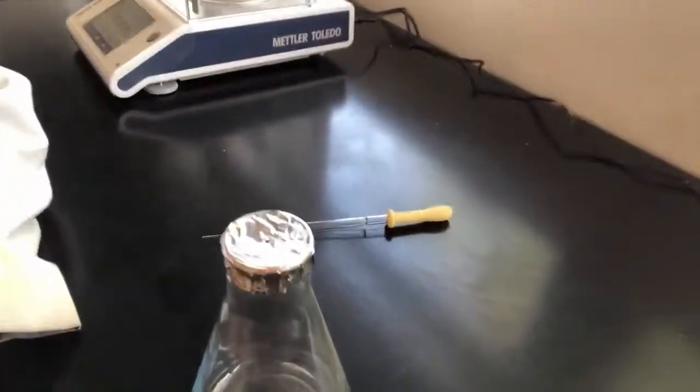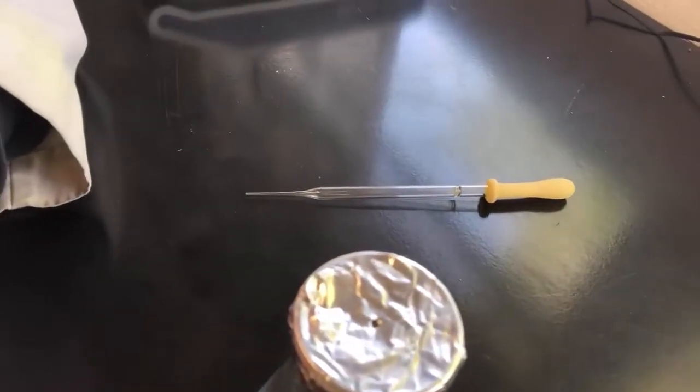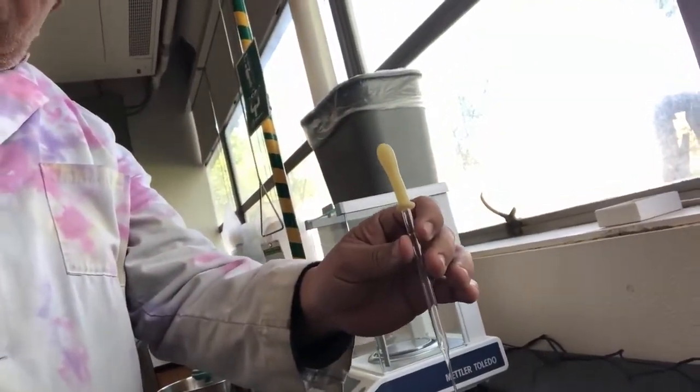If you look at the top, you may notice there's a little tiny pinhole. The way I made the pinhole was to take this glass pipette and puncture the lid with the pipette. That hole actually serves two purposes — it's how we'll get the liquid in there before we heat it, and it's also the hole where the liquid's vapor will escape so that the excess material in the flask has somewhere to go.